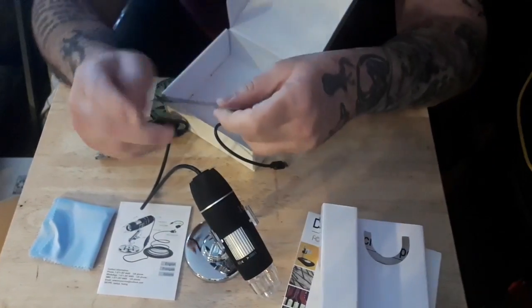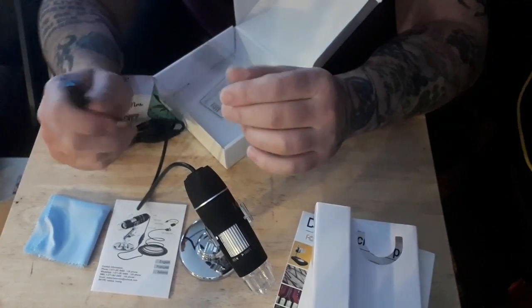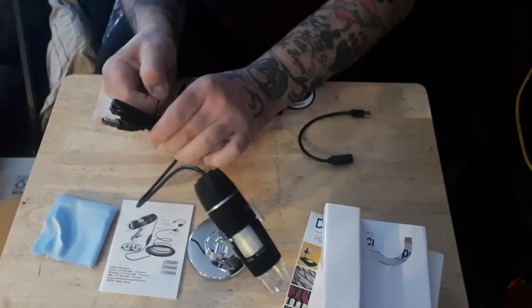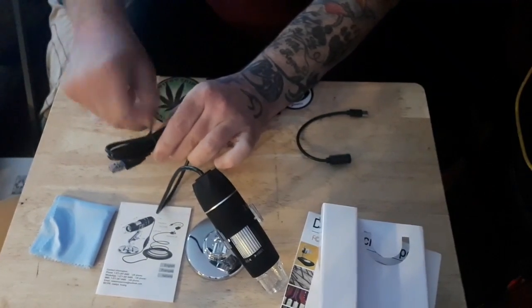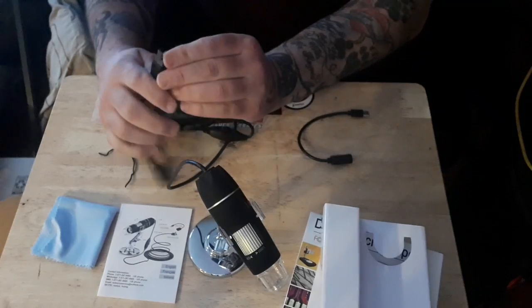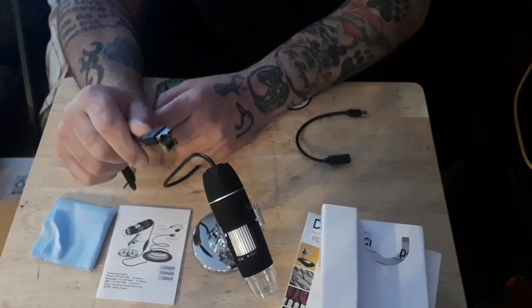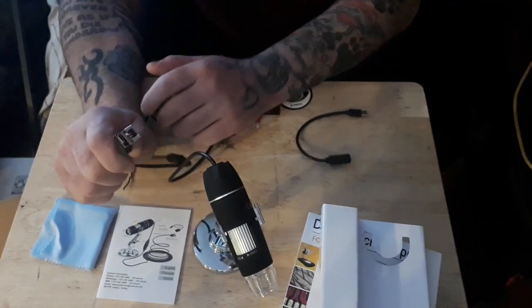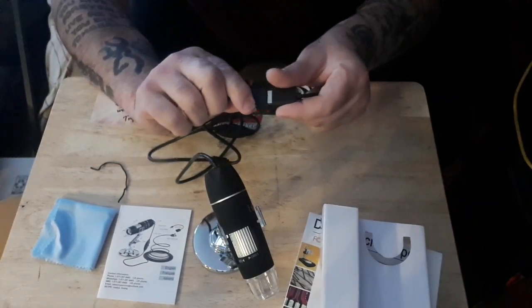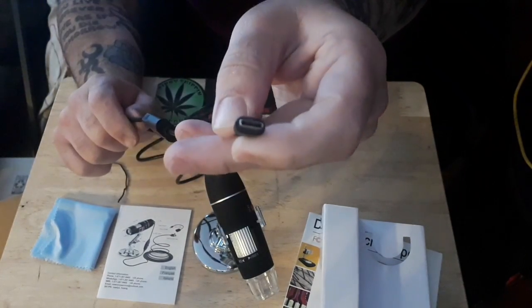What's this little thingy? A micro calibration ruler. It comes with — oh, it's a USB. Let me undo the cord. USB powered — oh look at that. So it has the original mini USB, like the old Samsung phones have. You push that back up and it turns back into USB for your computer or cell phone, and then it has a Type-C plug.